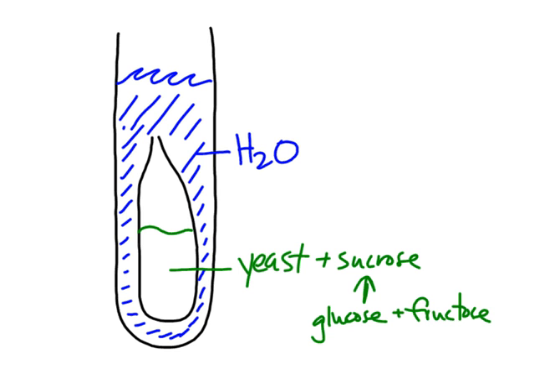So how we're going to change the temperature is mainly by putting in different temperature water. Okay, so what you'll do is take the pipette, not the test tube, and remove it, and then you'll put in different temperature water.